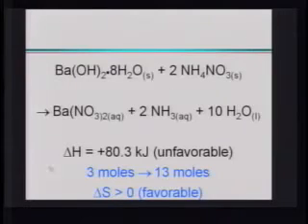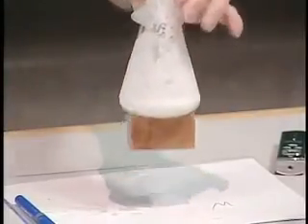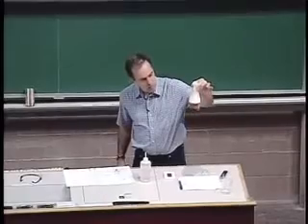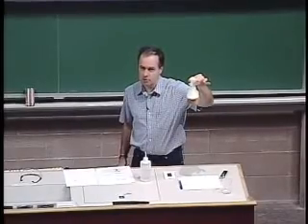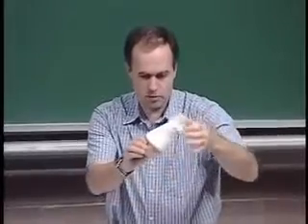So it's a huge increase in entropy, and that's why the reaction goes forth. If the entropy change was 0 or negative, the reaction wouldn't even happen. It wouldn't be spontaneous because the enthalpy is not favorable, and then the entropy wouldn't be favorable either, so you'd get a non-spontaneous change. This thing should be getting pretty cold by now. Not quite, yeah, it is there. So that block is so cold that it froze the water that I sprayed onto the block, and that's actually frozen right onto the thing.